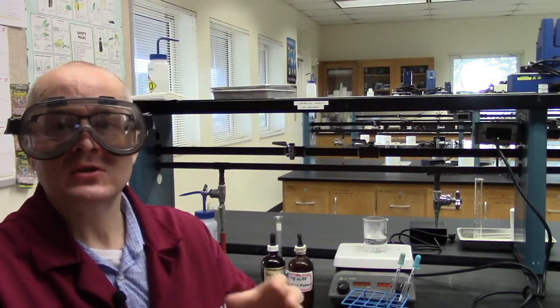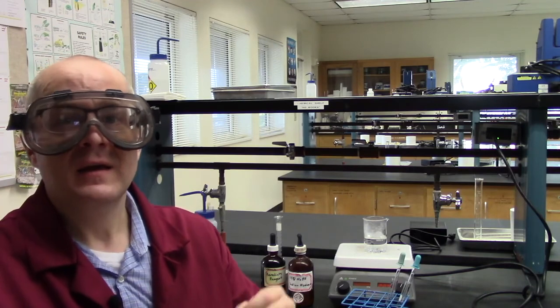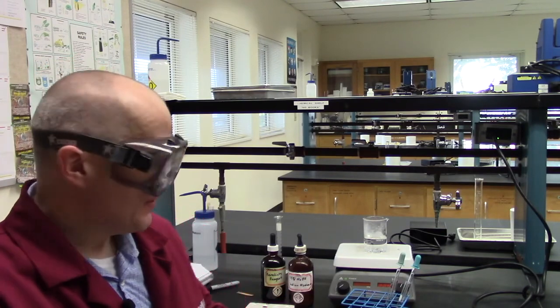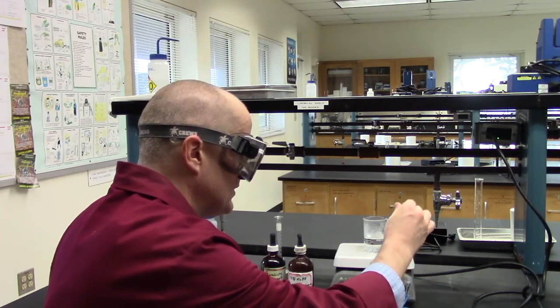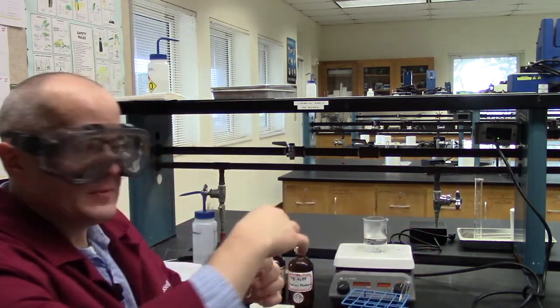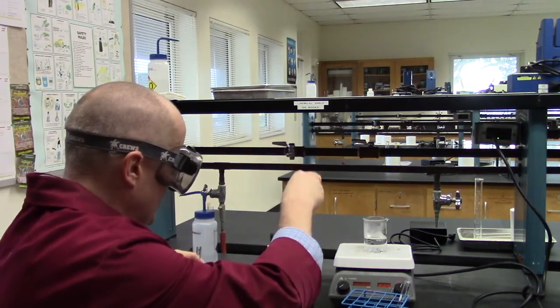Presence of Benedict's solution. So now we're going to test our starch digestion, the acid in starch, to see if there's glucose there. So let's do that experiment right now. I'm going to add a milliliter of Benedict's reagent to each one. So here's my acid. Here's my test tube that's labeled acid. I'm going to add about a milliliter of Benedict's reagent to it.